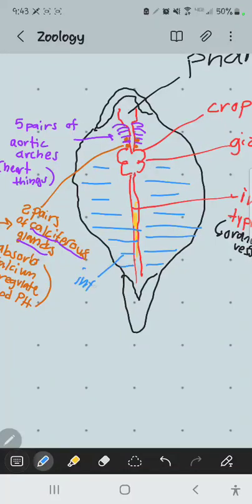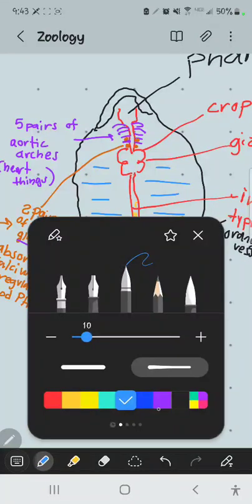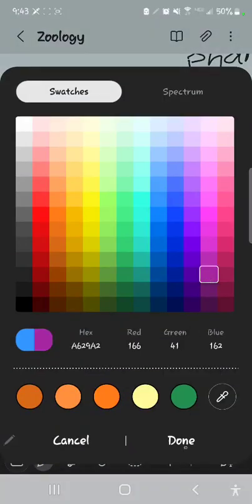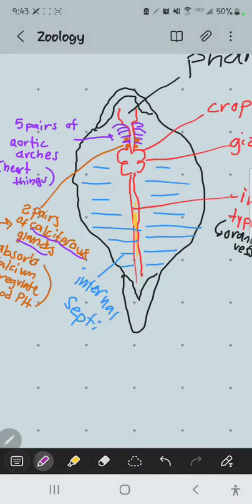They're pretty obvious. But the thing that's totally cool to see, if you can see it, is the osmoregulation organ of the worm. And this is what's called the nephridia. So the nephridia are like a hairpin loop structure that occurs in every segment.